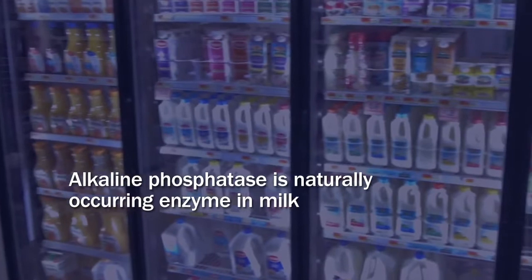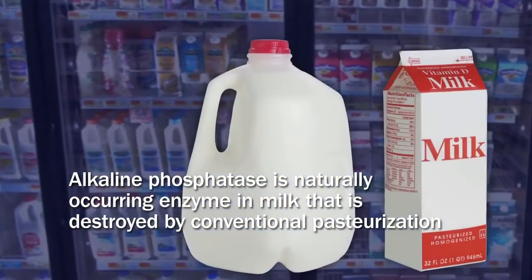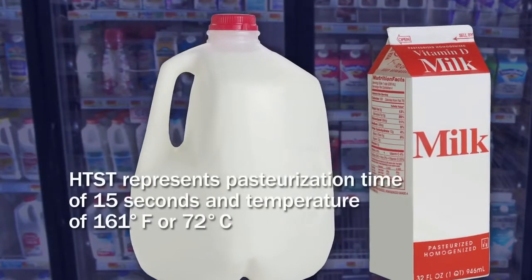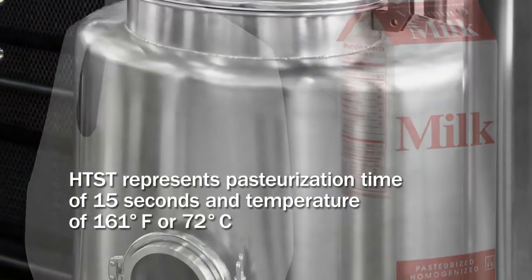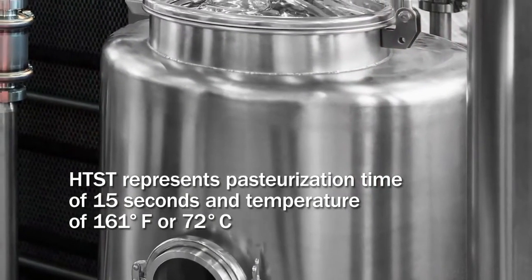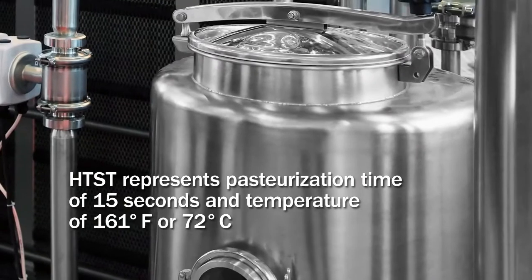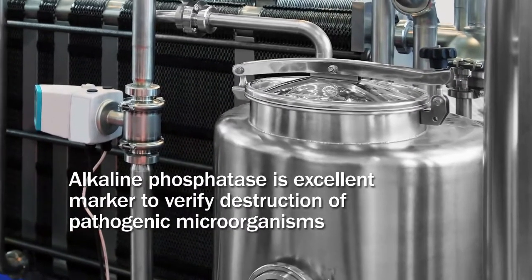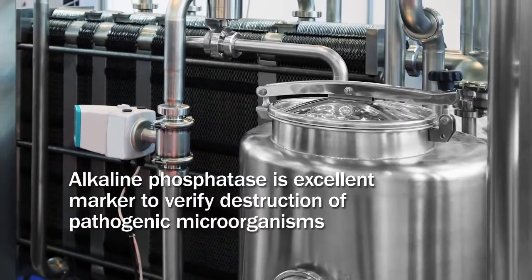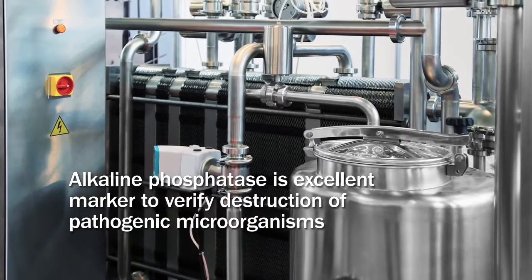Alkaline phosphatase is a naturally occurring enzyme in milk that is destroyed by conventional pasteurization. HTST, or high temperature short time, usually represents a pasteurization time of 15 seconds and a temperature of 161 degrees Fahrenheit or 72 degrees Celsius. This makes alkaline phosphatase an excellent marker to verify the destruction of pathogenic microorganisms in most pasteurized dairy products.